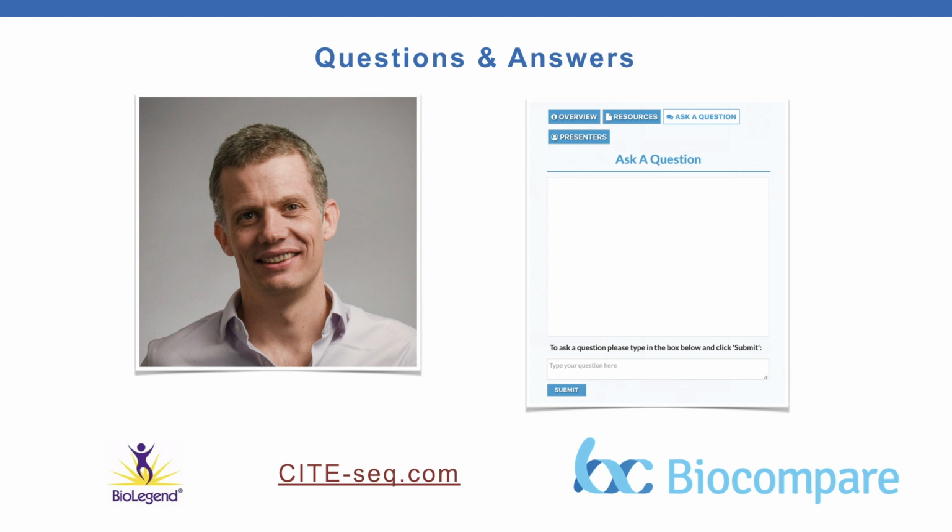Okay, so let me just start with this one because I have it up now. How many cells can you load with cell hashing? Well, you can probably load a very large number.